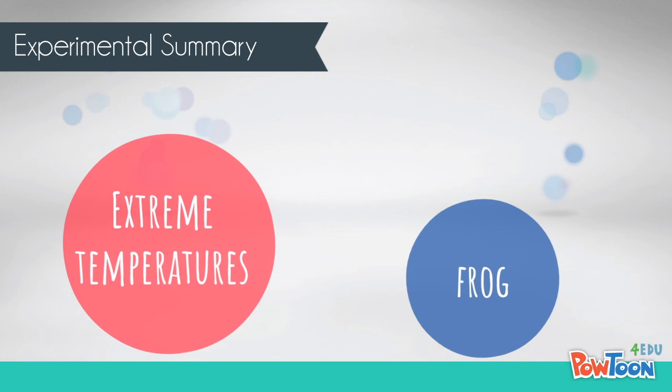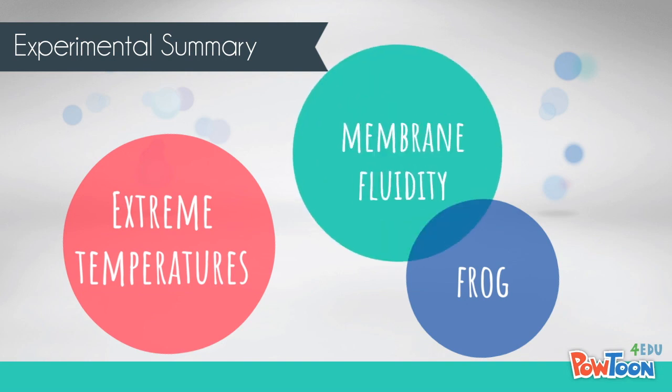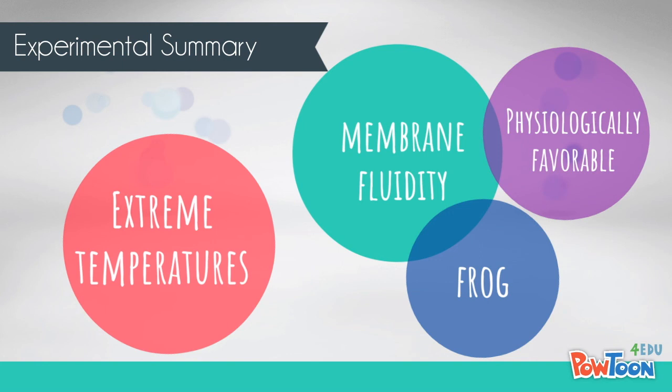The effects of temperature observed in these experiments result from membrane fluidity and sodium channel activity. Membrane fluidity increases with temperature. This leads to the recruitment of voltage-gated sodium channels. As a result, at higher temperatures, neural function exhibits a lower threshold, faster conduction velocity, and shorter refractory period. Colder temperatures induce depressed nerve activity. But in relation to our results, these trends only hold under physiologically favorable conditions that are species-specific.